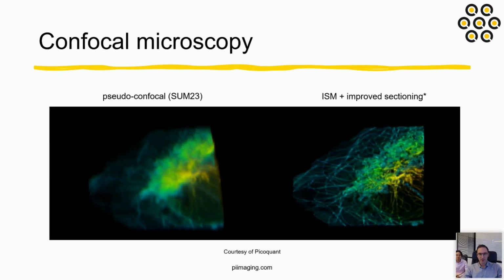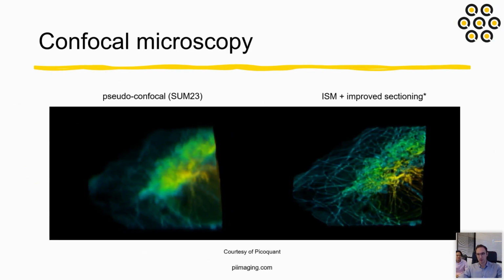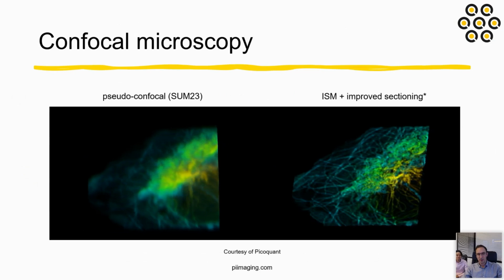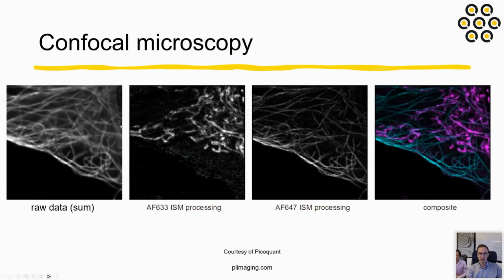Now we are switching to confocal microscopy in conjunction with the signal-to-noise ratio and, of course, the dynamic range. SPAD arrays enable super resolution imaging. Here I would like to emphasize the great work of our friends from PicoQuant as well, showing the difference between just normal confocal imaging and then confocal imaging enabled by SPAD arrays, improving the resolution by a factor of approximately 2. You can see more details on this slide, where we go from a blurry image like here on the left-hand side, and then being able to differentiate 2 different fluorophores within the sample because of the time tagging that we have, and then mapping that all together in a beautiful color image with super high resolution.